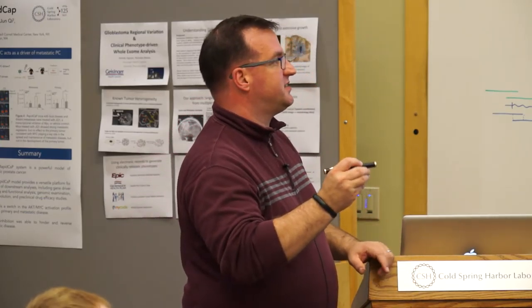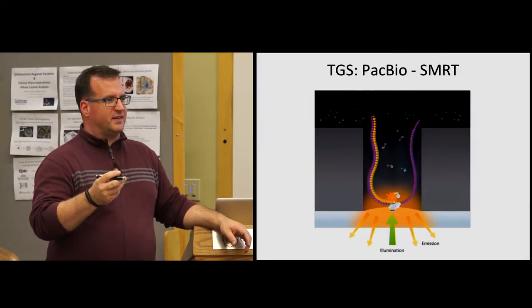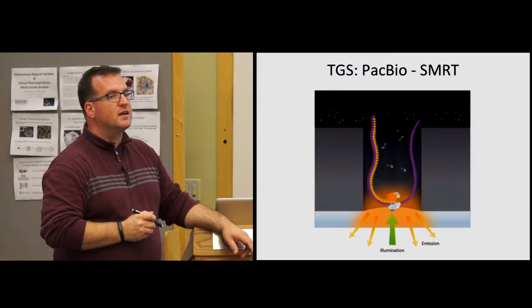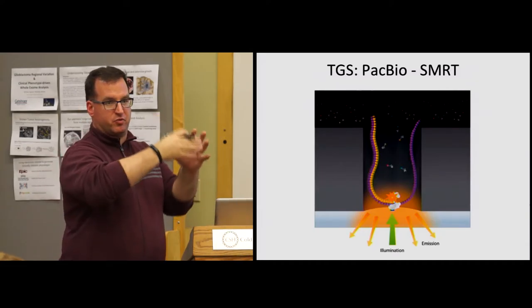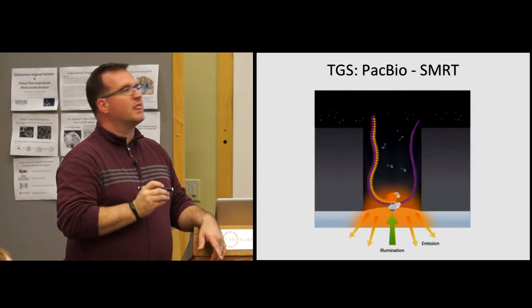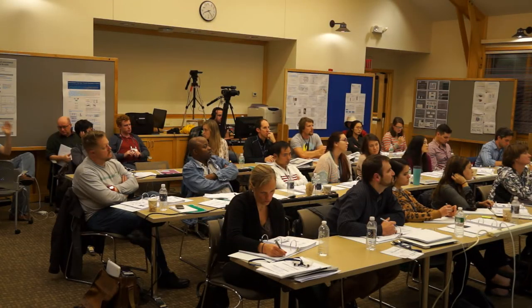And just to be fair, I haven't done justice to the technology and engineering that went into this enzyme. They've also done things to make it kind of laser stable. They slowed the processivity down, and there's something else that they did too, if anyone remembers. So that's about the size of this pore and the distribution of the pores on the sheet such that they don't get the side scatter. Is that what you're talking about? The fluorescent side scatter? Oh, the physical orientation of the laser. I see. Okay.